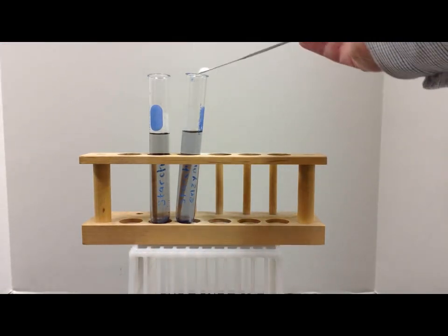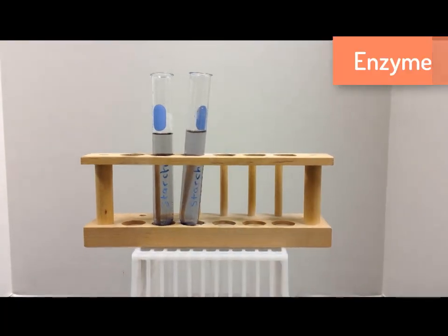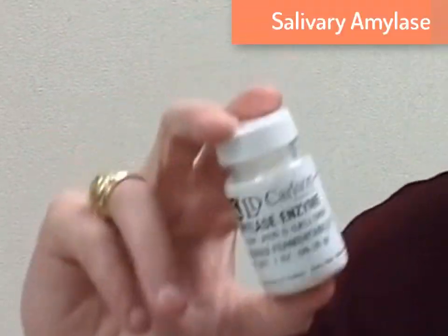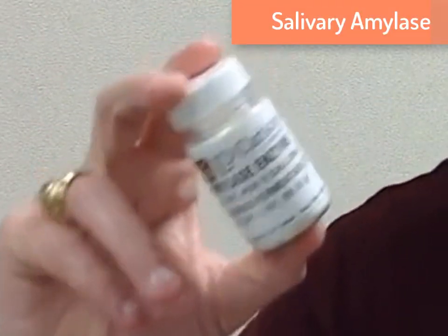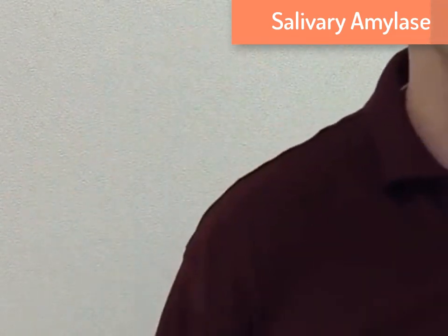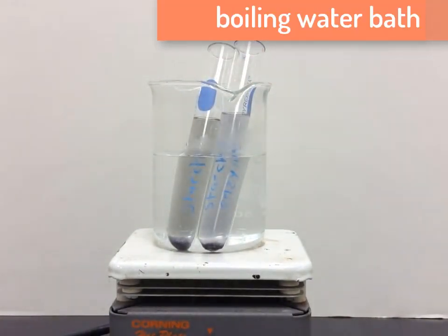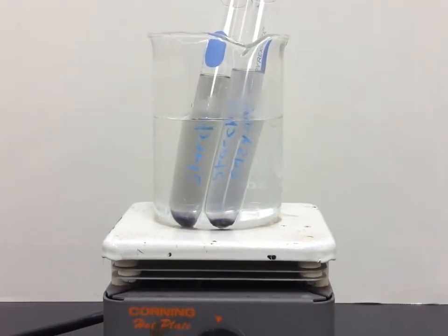To one test tube, we'll add an enzyme that will digest these starch molecules. The enzyme we'll be using is called amylase. It's the same enzyme that's found in your saliva, and allows your body to start digesting starches as soon as you begin to chew your food. We'll place both of our test tubes into a warm water bath. This will allow our enzyme to work much faster.